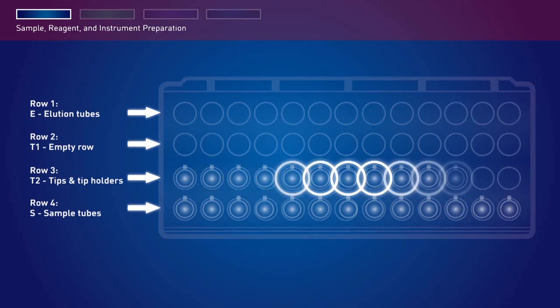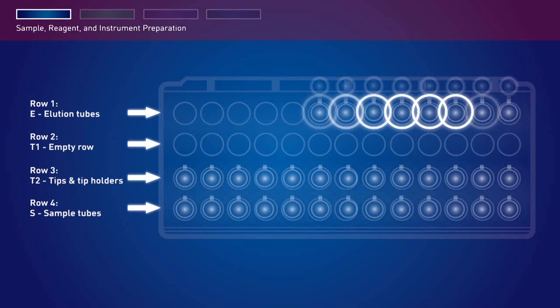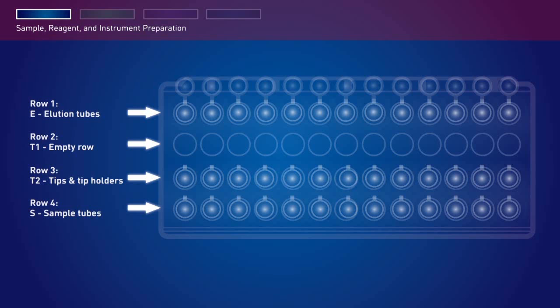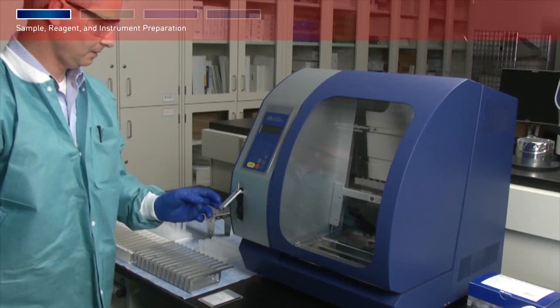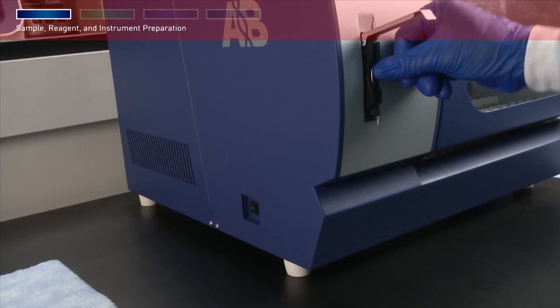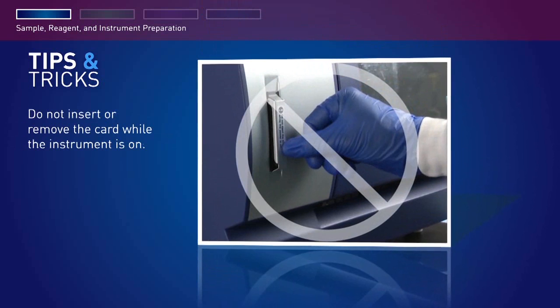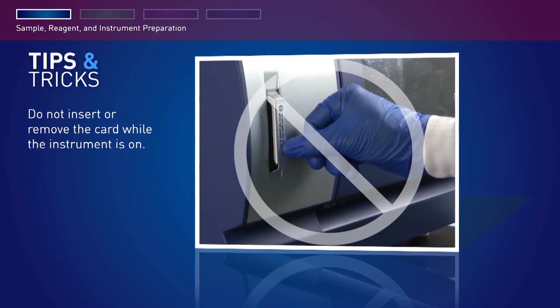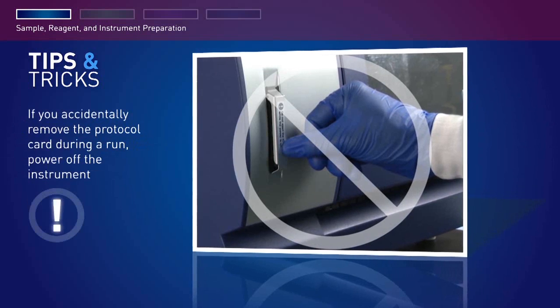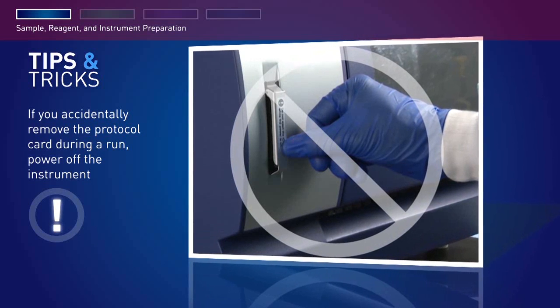In row T2, the third row, load Automate Express system tips inserted into tip holders. Leave row T1, the second row, empty. Row E, the first row, load with labeled PrepSEQ kit elution tubes with the caps open and secured as shown. Open the card slot and insert the PrepSEQ Express kit protocol card with the arrow pointing toward the instrument and the card label facing left, then close the card slot. Do not remove or insert the protocol card while the instrument is on — removing the card stops the run and may cause instrument data file loss.